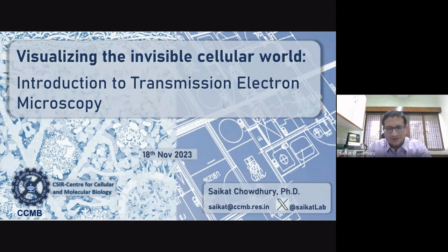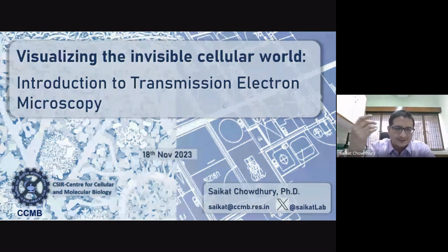So I'll briefly touch upon what I do, but primarily I'll focus on the tools and techniques and give an overview within 1 hour, whatever I can, a crash course of something that has been developed over several decades, almost more than 50 years it has taken for Cryo-EM to come to where it is today. And I think you must have heard a lot about it from Dr. Natesh earlier. I have been doing different structural biology methodologies, and in the last 10 to 12 years, I've been primarily using Cryo-EM as a tool to understand different macromolecular structures and using it for my own research.